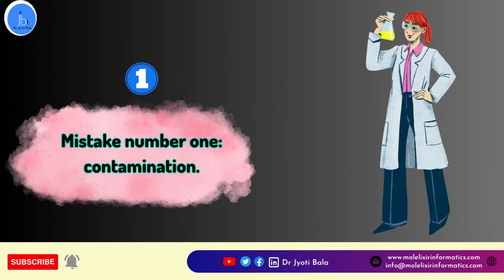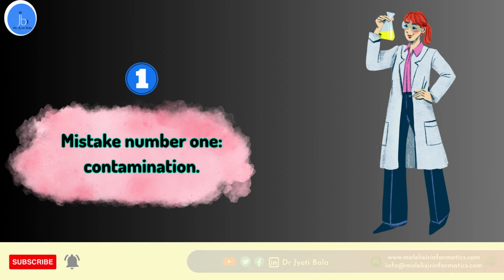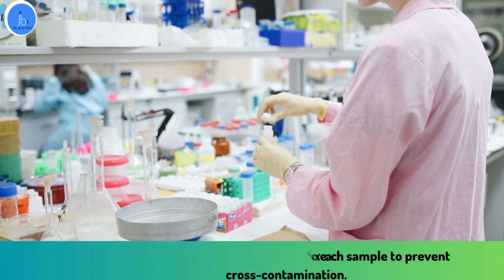Mistake number 1 is contamination. Always remember to keep your work area clean and sterile. Use separate pipette and tips for each sample to prevent cross-contamination.